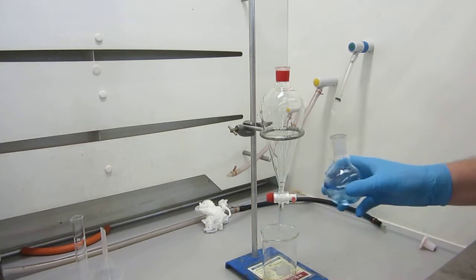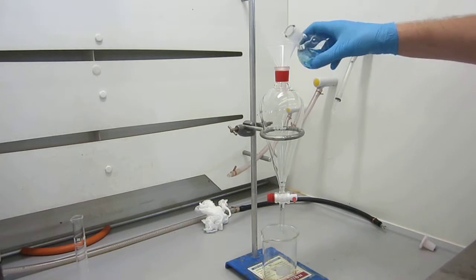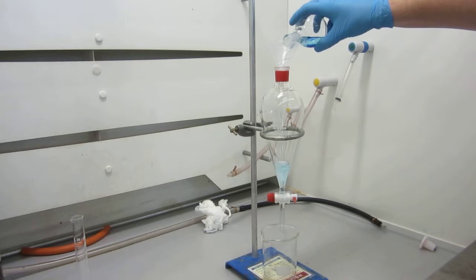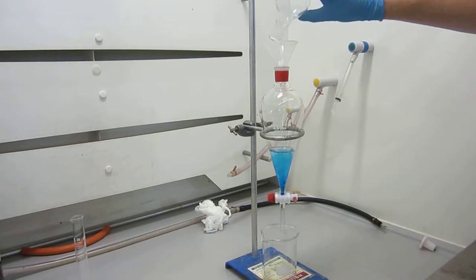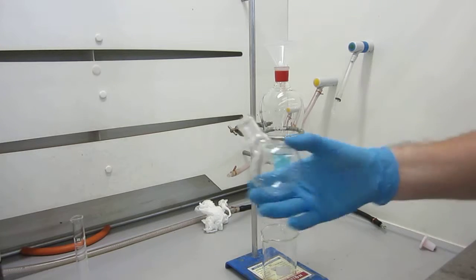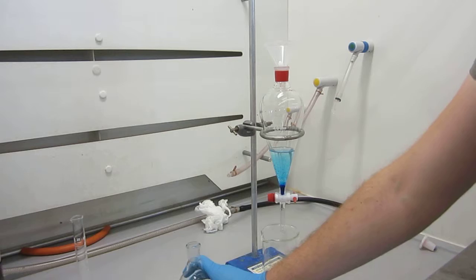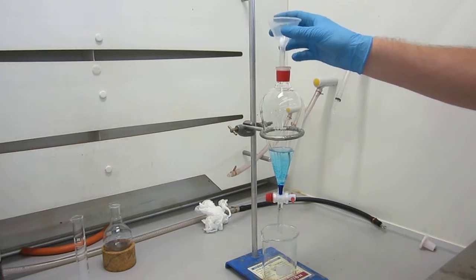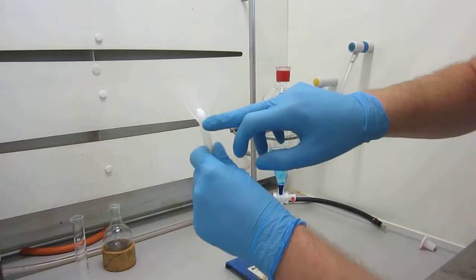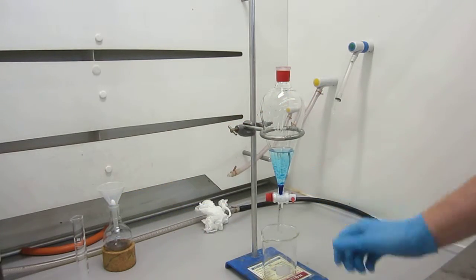So we're going to get our funnel, if we've got one, and we're just going to pour all of our reaction mixture into our separating funnel, like so. And you can rinse this out with some solvent if you need to, but I'm not going to for this because I'm not bothered about the yield. So that's going to go to the back, and take the funnel out. It's conveniently grabbed my stirrer bar from the reaction. And so we've got our separating funnel.